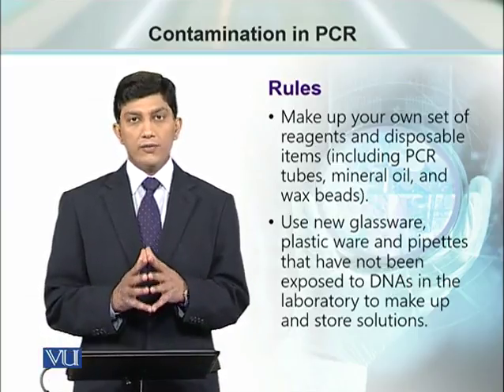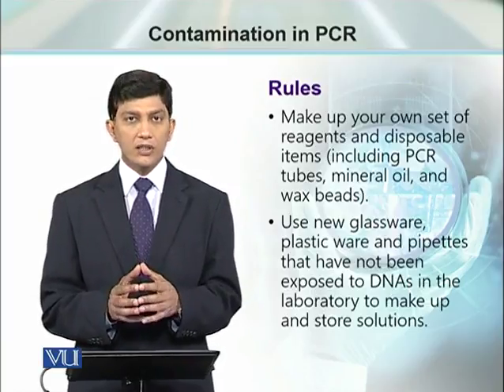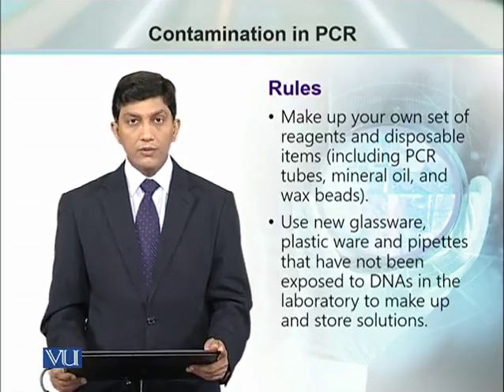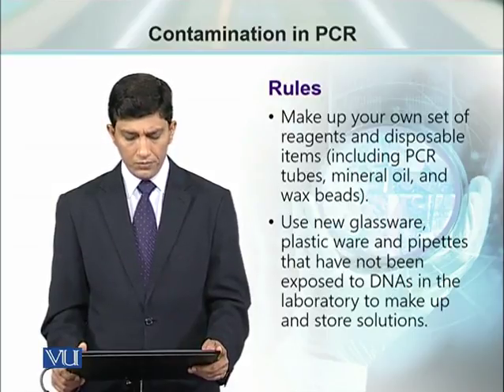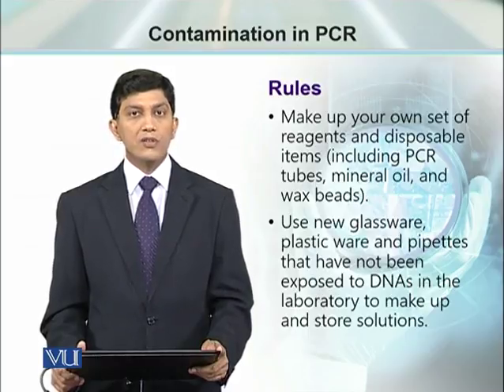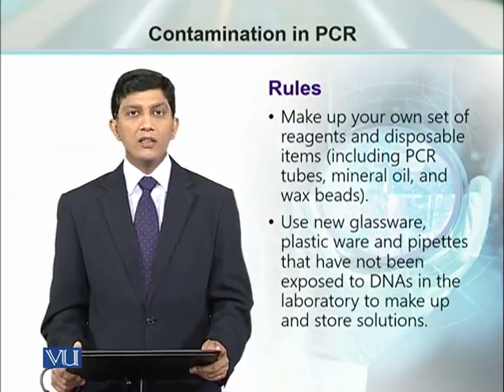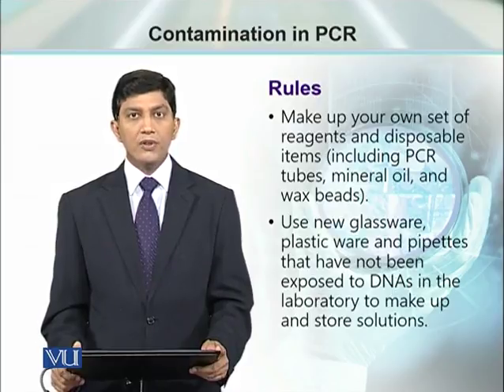Always rely on yourself. Don't try to save your time by using the reagents from others. Try to prepare all the reagents and materials by yourself so that you can be sure that no contamination can be there. The glassware, plasticware and pipettes which are used to set up a PCR reaction should not be exposed to any other DNA samples in the laboratory. Again, you should set up a separate set of supplies for the PCR.